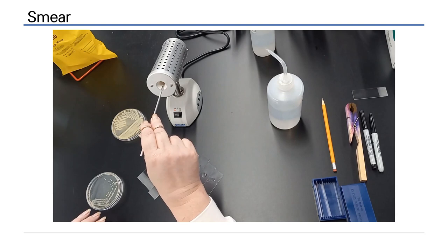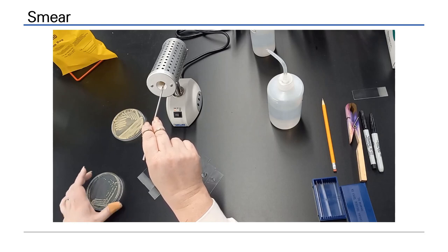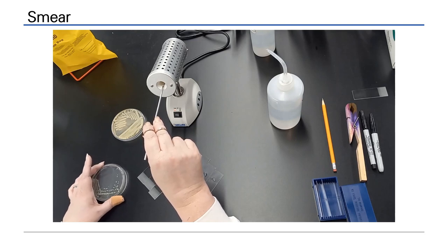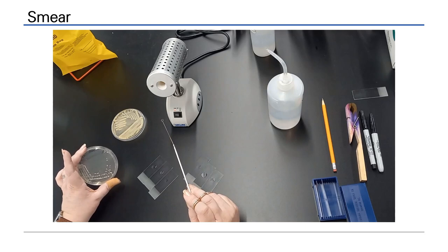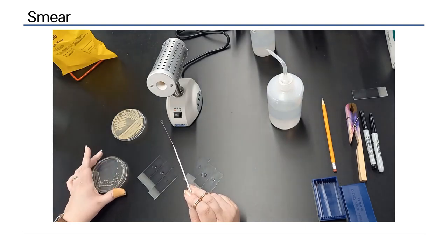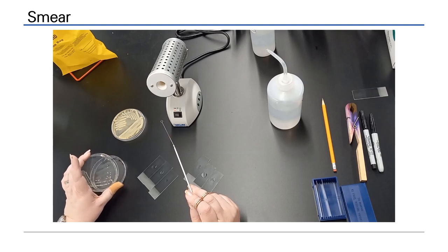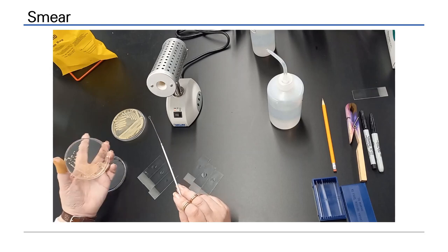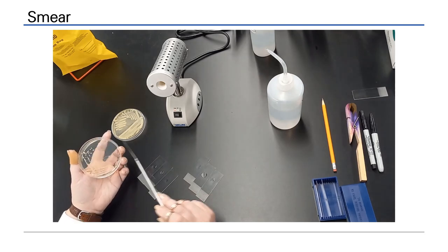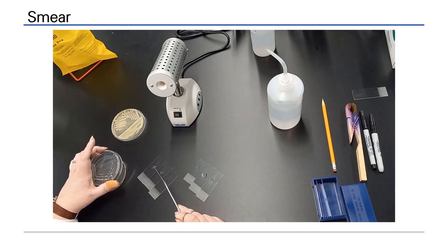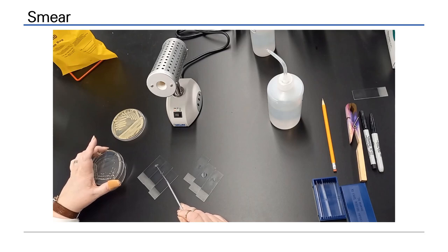Sterilize your loop. Cells will be removed from the plate and re-suspended in each drop of water. Pick an isolated colony to ensure purity. The loop may be touched to a sterile region of the plate to ensure that it has cooled. Pick a single colony. Remember this contains millions of cells and is more than adequate to produce a smear.